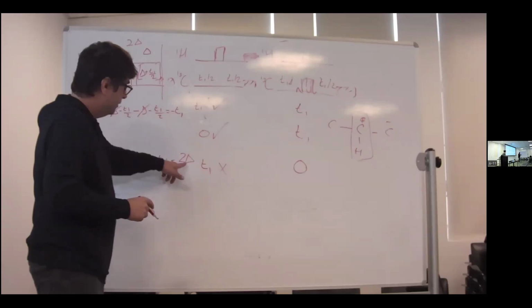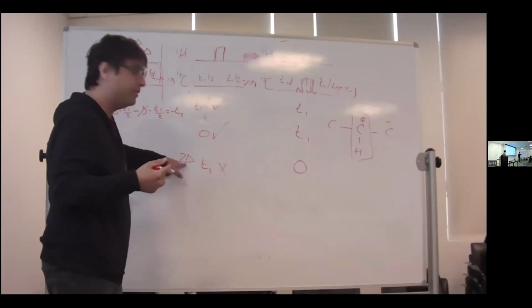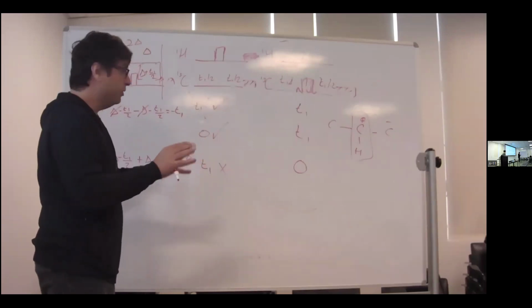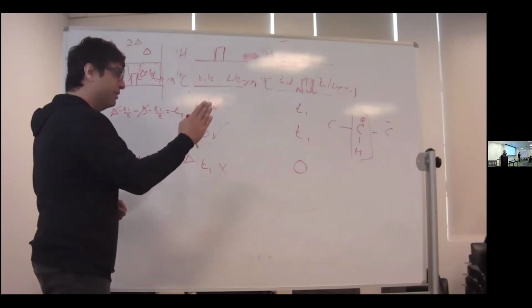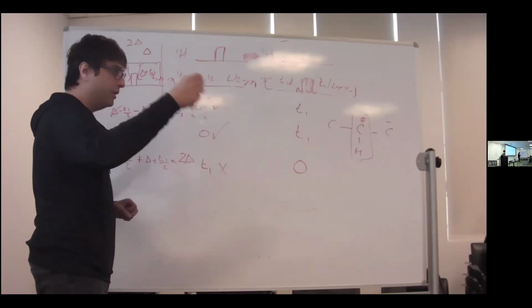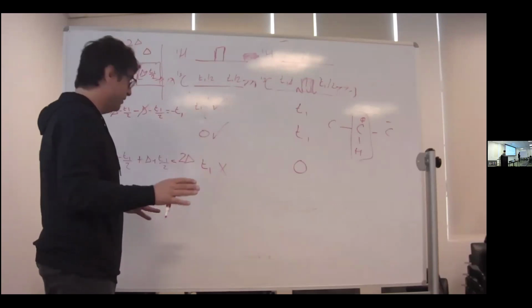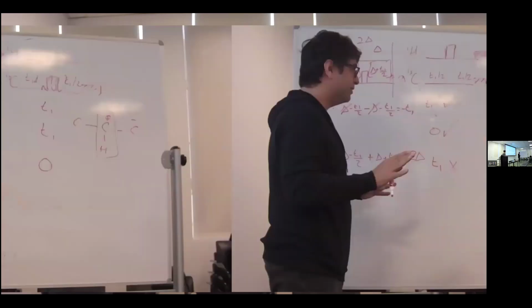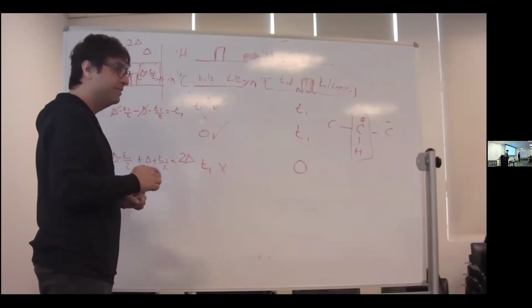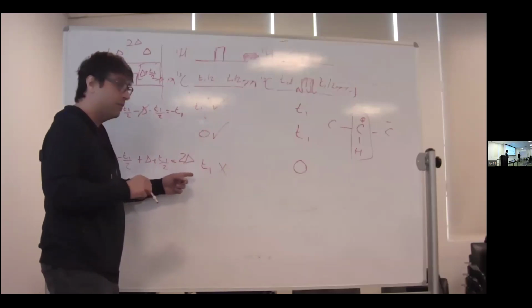So carbon-carbon coupling has evolved, but for a fixed period, delta, not T1. There's no little t. As I move the pulse to the left, as you suggested, I am not generating a signal where the J coupling is modulated by little T1. I've gotten rid of it. Is life perfect? Why isn't it perfect? Well, it will take away signal, depending on the magnitude of that J coupling.